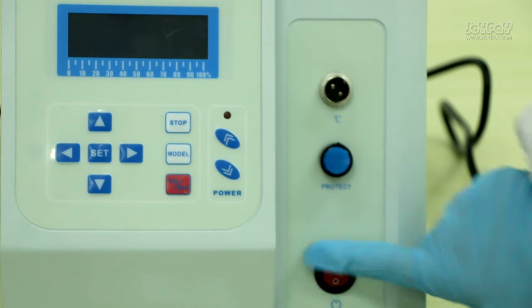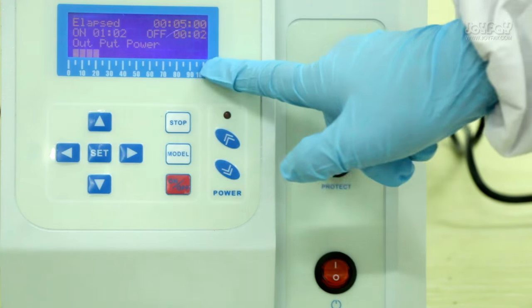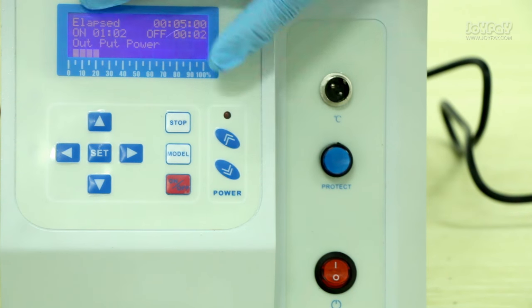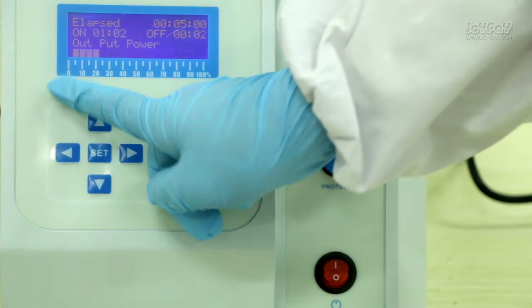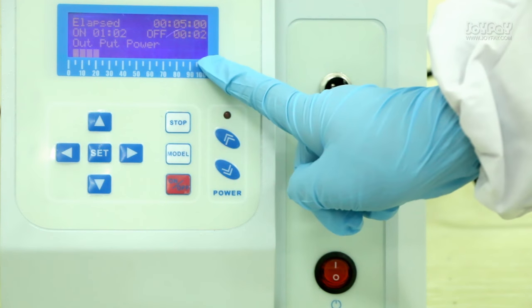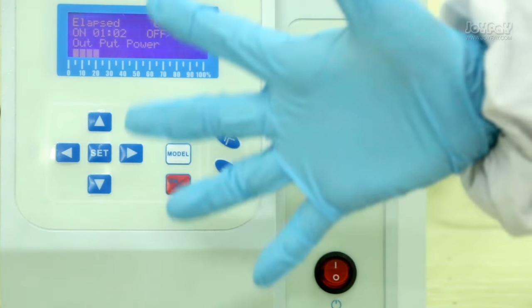Press the red power button and you will see something appearing on the display screen. The first line shows the total working time of the machine. 'On' shows the time of on-pause. 'Off' shows the time of off-pause. The small cubes at the bottom show the output power of the machine, and every small cube represents 5% of the power.